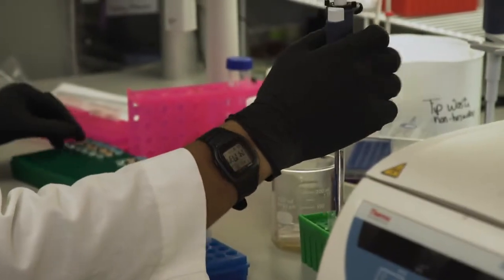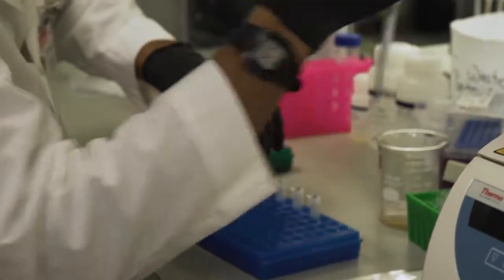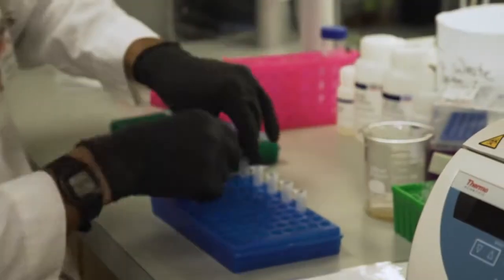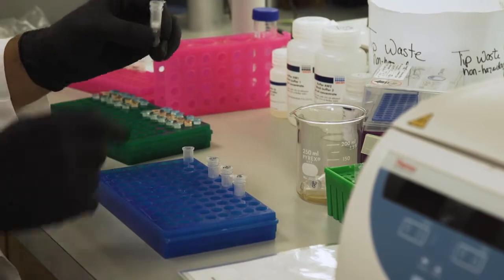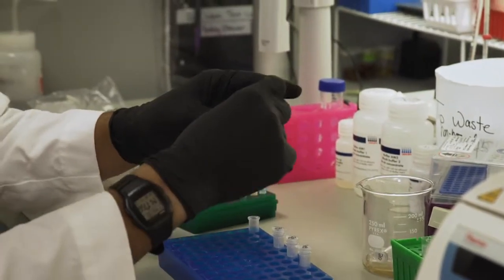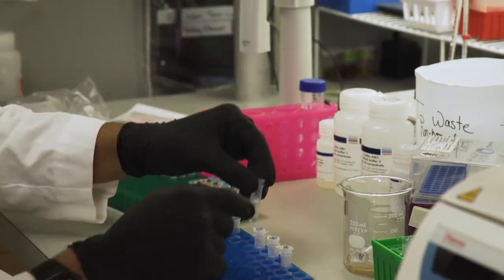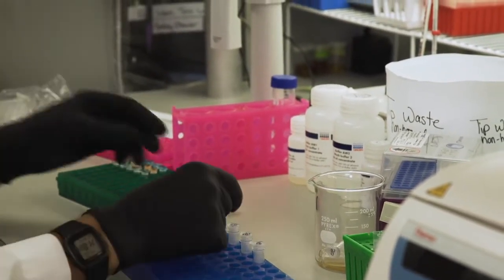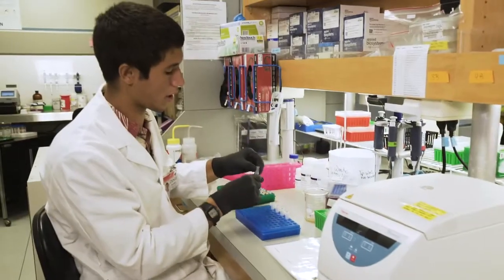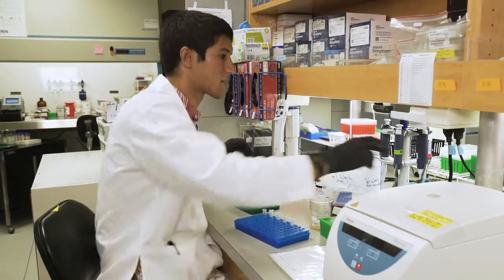And then we'll go ahead and what's called aliquot our sample, or our DNA product, into their tubes. Usually we'll only toss one filter column at a time and let the rest sit. That's to make sure anything in the air doesn't get into our sample. And two, the only labeling on the tubes is on the top. So once you pull them all off, they all look the same. That would be bad because we don't want to mix them up.